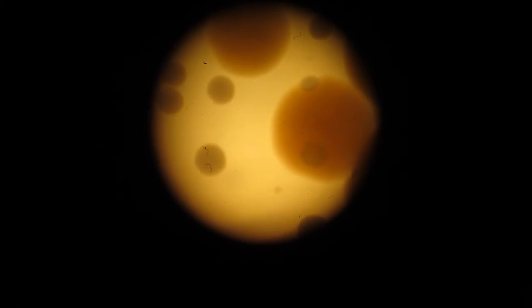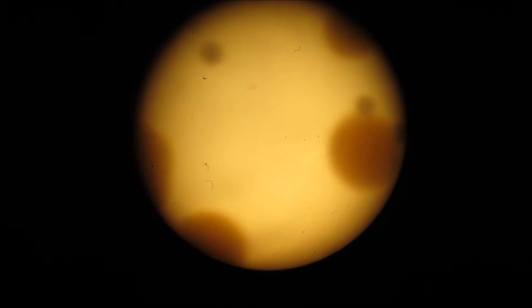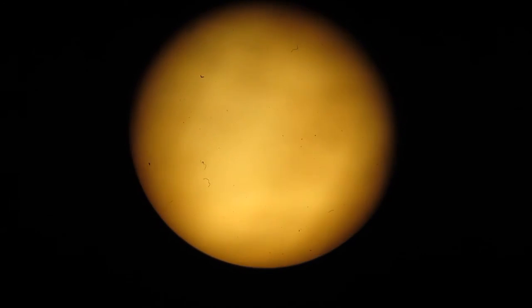This project was done pretty hastily - I had inoculated these right before bed, and because of that I had forgotten to leave half of the plates clear to test whether the agar itself was infected. I don't believe the agar was, though, because some of the cultures, such as the clean baby bottle nipple, had absolutely no microbial growth.